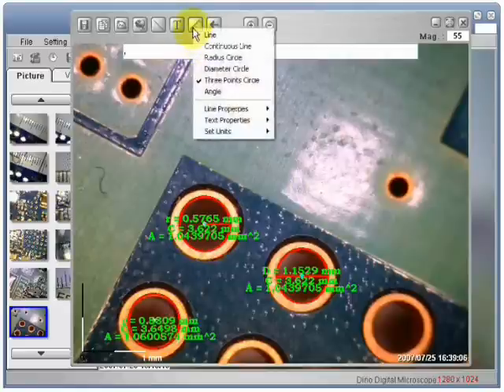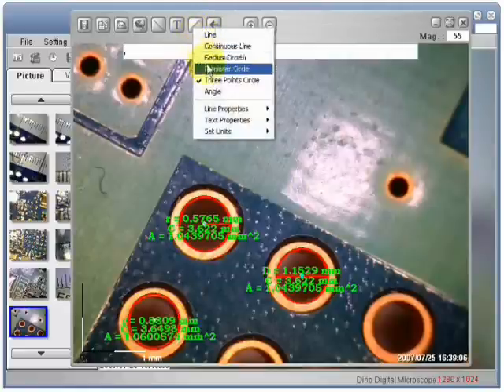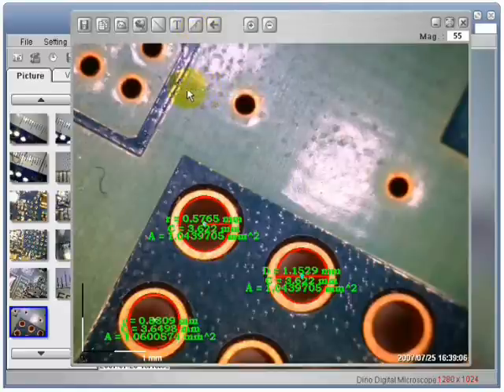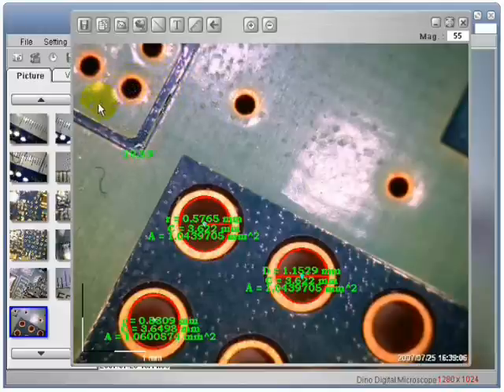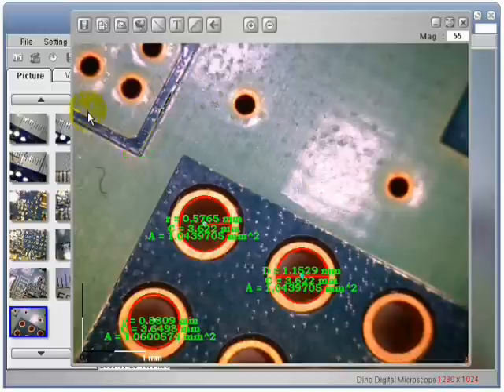Now I am going to choose to measure an angle. Left click once for pivot point. Click again for starting position. Click again for ending position.